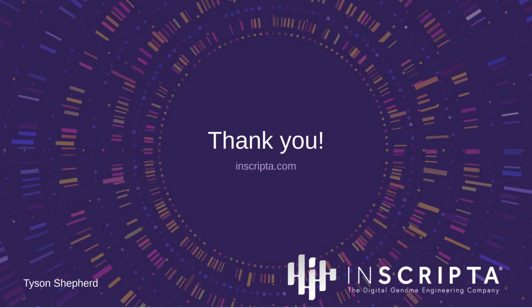Great. Next question. He said, thank you for the wonderful presentation. Can the Inscripta system be used in in vitro production of siRNA? To improve siRNA, another really cool question. So here, of course, we were focused on protein production, but instinctually, my gut feeling is absolutely, in a way.